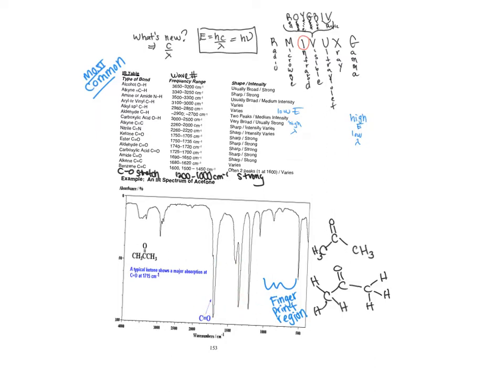Okay, so now I'm ready to point out what's important in the acetone spectrum. So we had this carbonyl. Notice not the whole x-axis is labeled, but I could at least tell that if I have 1,500 here, 1,600, that's 1,700. Now let's see where that matches here. 1,700. Notice this says carboxylic acid CO, amide CO, aldehyde CO, ester CO, ketone CO. They all overlap.